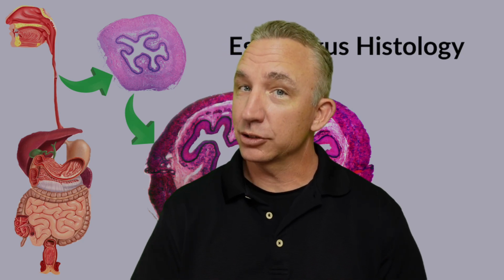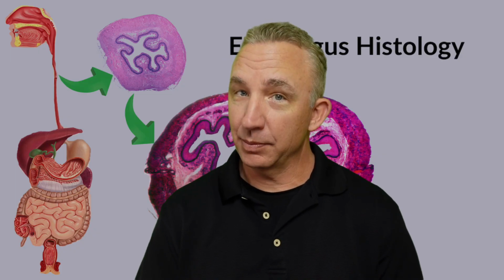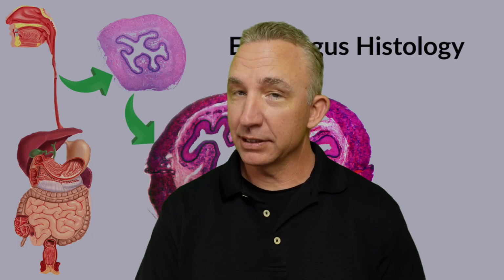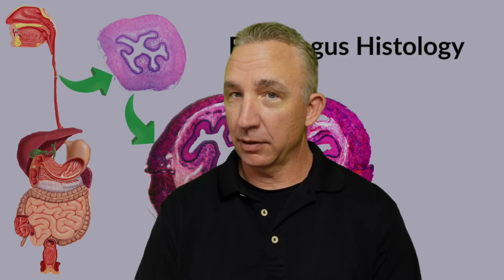And then we get into our muscularis externa, which typically is a circular and a longitudinal layer. We have 1 extra layer in the stomach, which we call the oblique. And then the outside of the esophagus, the outside of the tube, we call tunica adventitia. When we go through stomach, small intestine, and large intestine, it is referred to as tunica serosa. And then the rectum varies depending on which part we're looking at, can be serosa and adventitia.